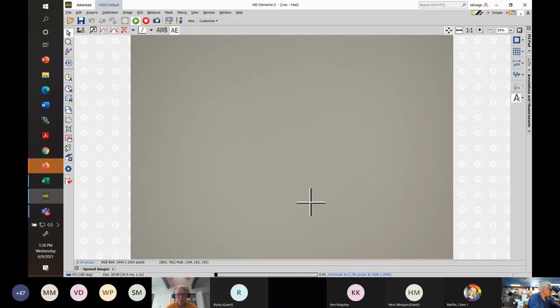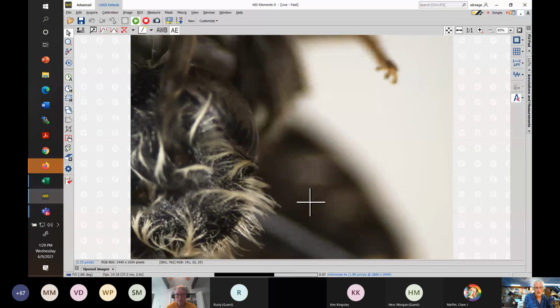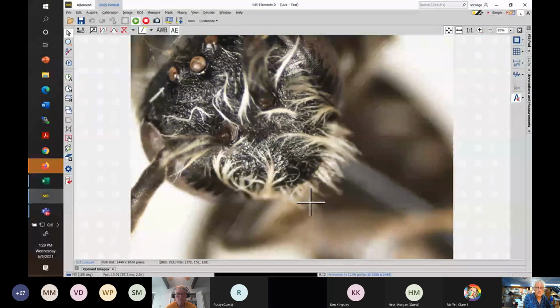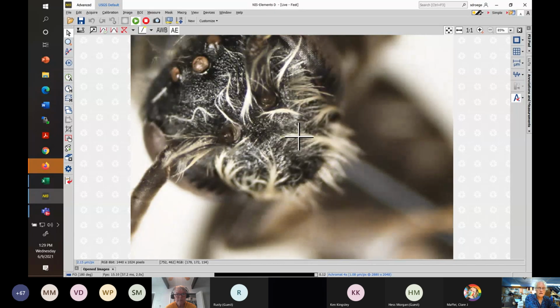I'm going to pull nasonii, because compared to other Andrena, it has a relatively not hairy face. And the general notion of hairiness in the Andrena, hairy faces is a good character at the vibe level, I would say. So it's not definitive, but when you're just trying to get a feel for these groups, then a lot of times these kinds of characters, like generally has a hairy face with long hairs on it, is a pretty good one. But we don't use it in the guide because there's a lot of exceptions, or sometimes it feels like it's not hairy because it's goopy.